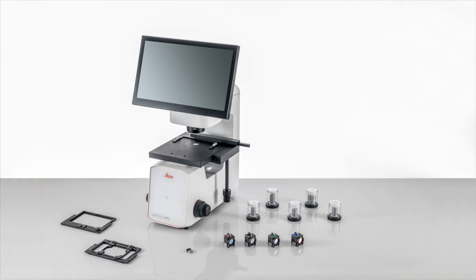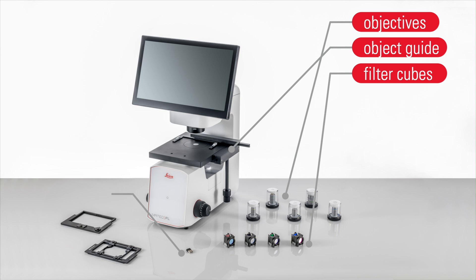Based on your purchasing configuration, you may receive the following components: objectives, an object guide, filter cubes, Wi-Fi dongle, barcode scanner and a thermal plate.